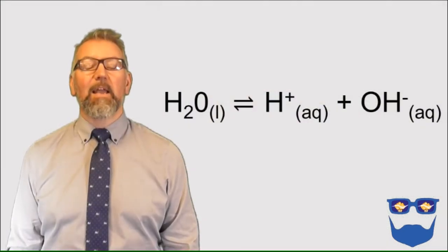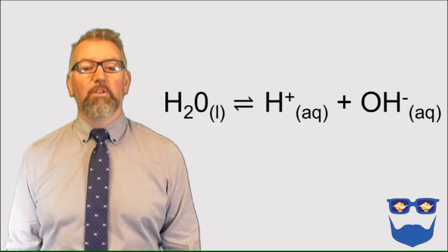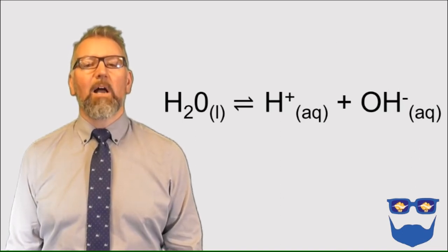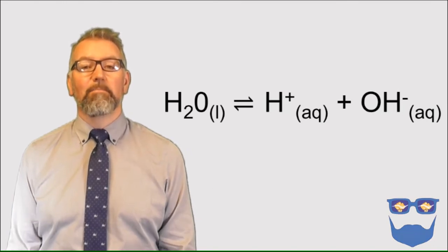The usual experiment is to test 4 known aqueous solutions: sodium sulfate, sodium chloride, copper sulfate and copper chloride. We need to fully understand that aqueous solutions include our dissolved substance and water. Water will partially split into hydrogen ions and hydroxide ions. These ions can also be manipulated when the electricity is switched on.